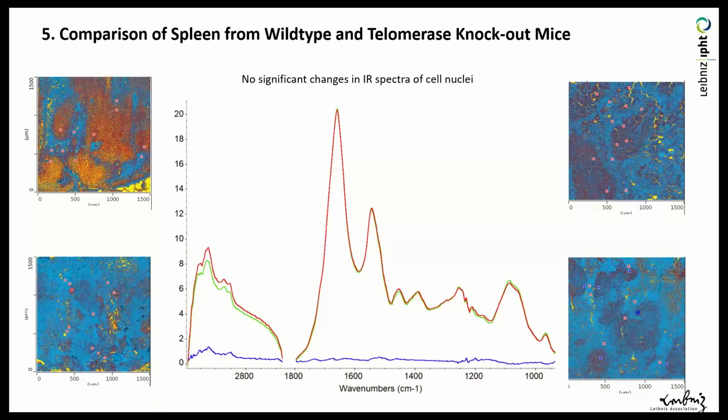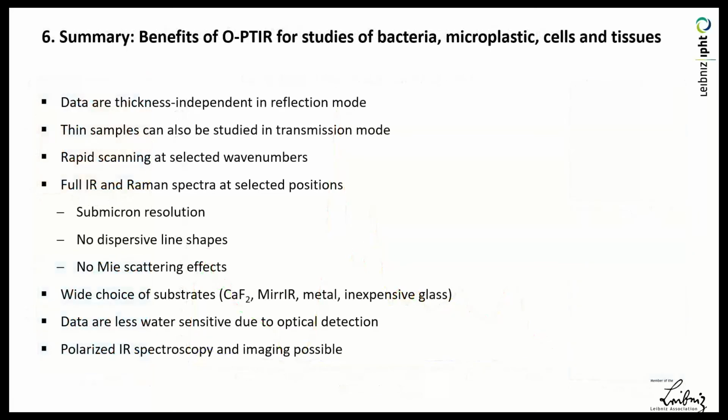We continue this kind of research because our clinical partner wants to induce infections, and then we will repeat these experiments with infected mice and study organs like spleen, and we also had liver and kidney tissue sections. So there's a lot of work in front of us.